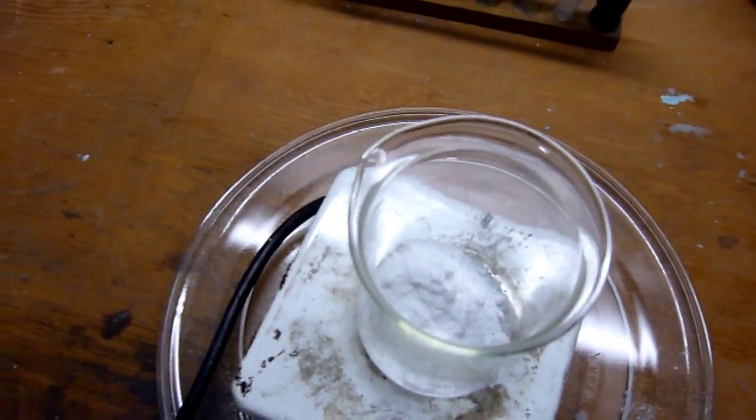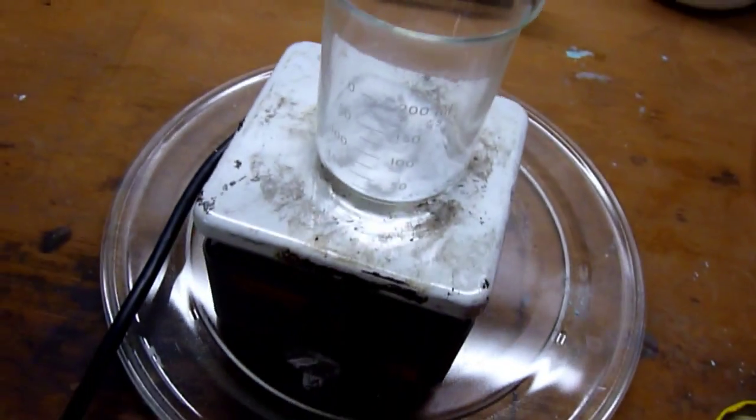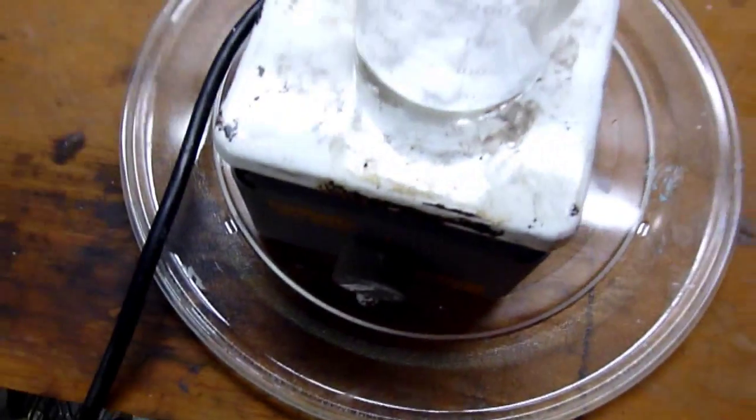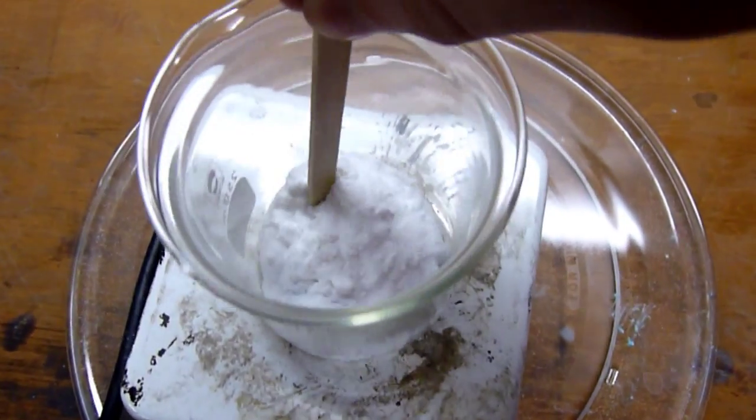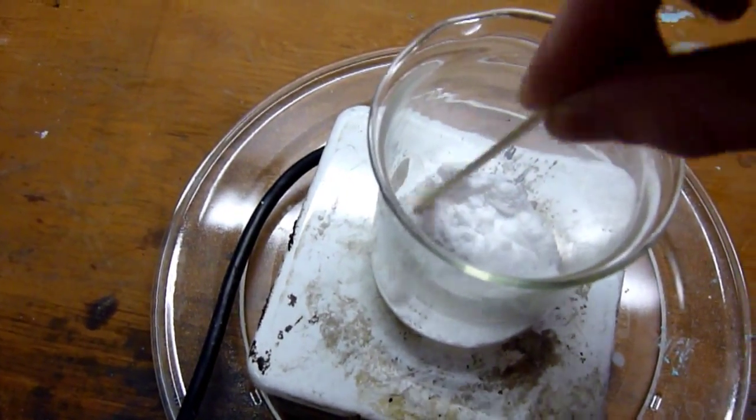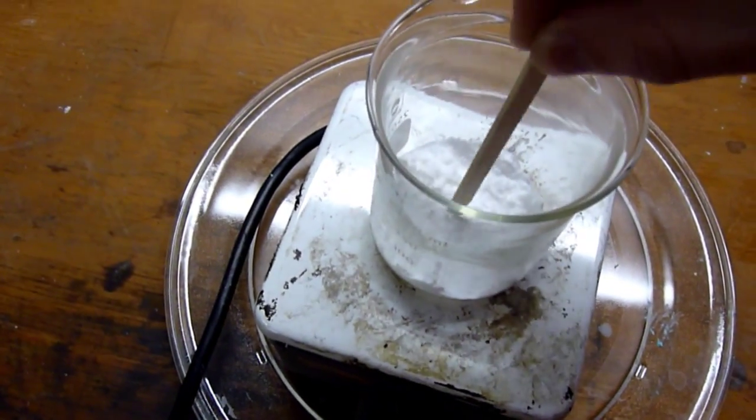However, sodium hydrogen carbonate can decompose at as low as 50 degrees Celsius. So, as long as you have the majority of it decomposed, you won't have that much of a carbon dioxide problem with your final product. So, as you can see here, we're losing some water. It's starting to get kind of sticky near the bottom.